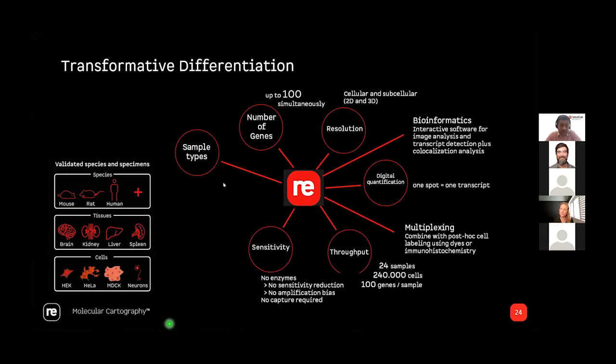Of course, I showed you representative data. And of course, you have to give 5% here and there. So we are doing a lot of statistics on this using different cell culture systems and also in tissues. So based on the data that we have available at the moment, we are, let's say, in the range of 95 to 100% when it comes to single molecule FISH.